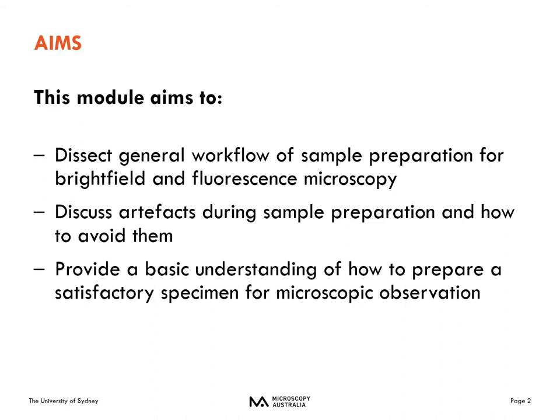This module aims to dissect the general workflow of sample preparation for bright field and fluorescent microscopy. We'll discuss artifacts during sample preparation and how to avoid them. In the end, we'll provide a basic understanding of how to prepare a satisfactory specimen for microscopy observation.